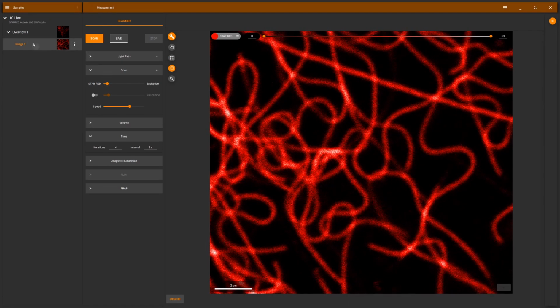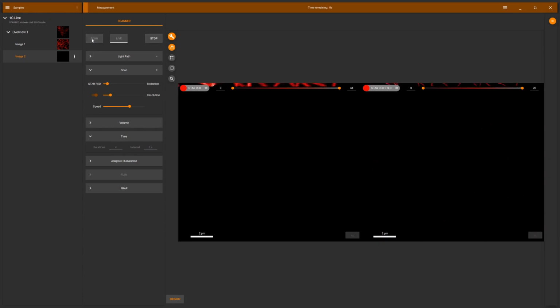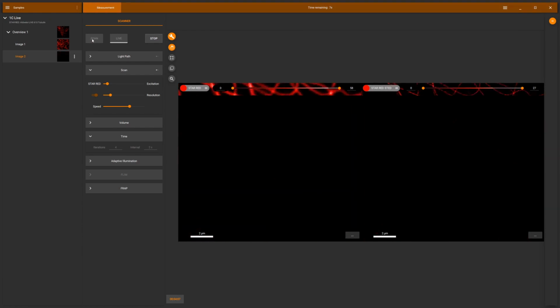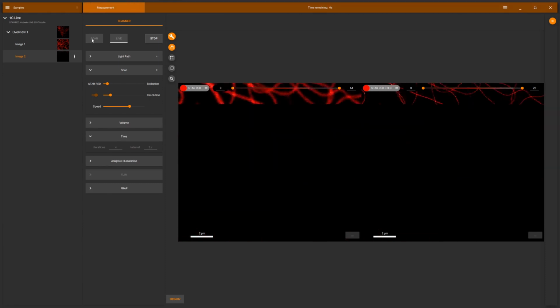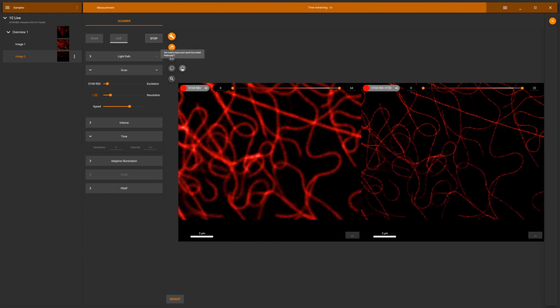We now copy this image by dragging it to the overview, activate STED, put it to 15% STED power, and we do again 4 iterations, and I press scan. Same thing here, we get nice iterations, we get a good or very good increase in resolution here, and we will do multiple frames to show you the ease of doing multi-time-lapse imaging in live cell STED.